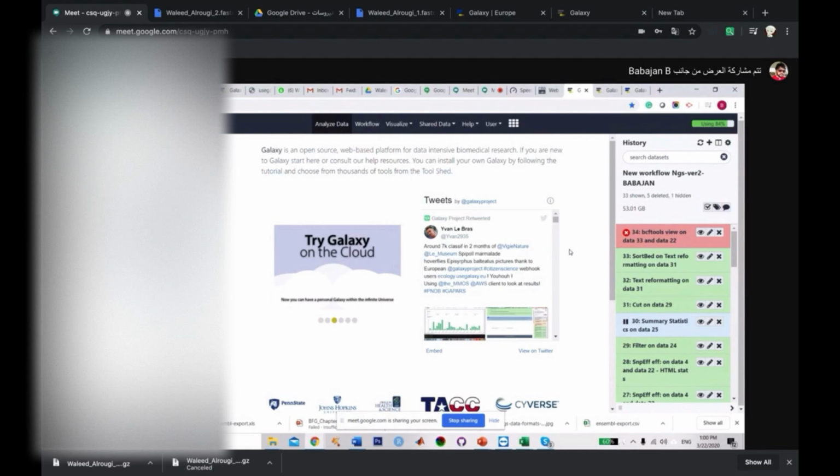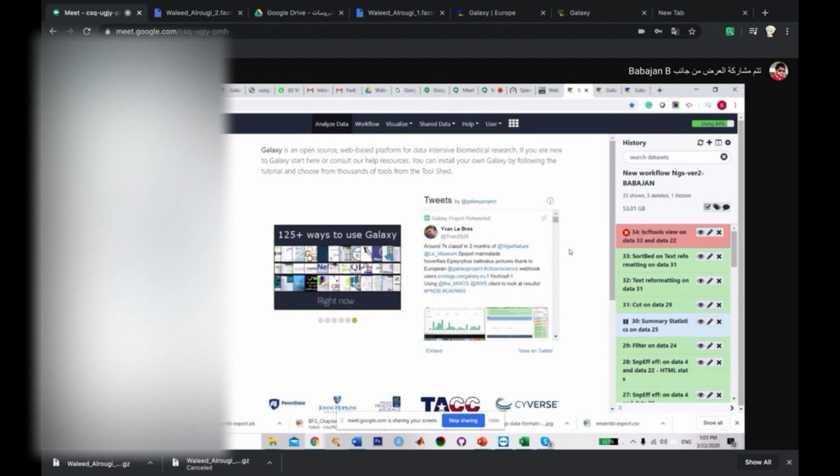As I told you, we need a very high-end server. At least 32 to 64 gigabytes of RAM, an octa-core processor with 3.5 gigahertz Intel processor, and also a minimum of 12 GB of VGA card to do the NGS analysis. So we need to check for some alternate option.